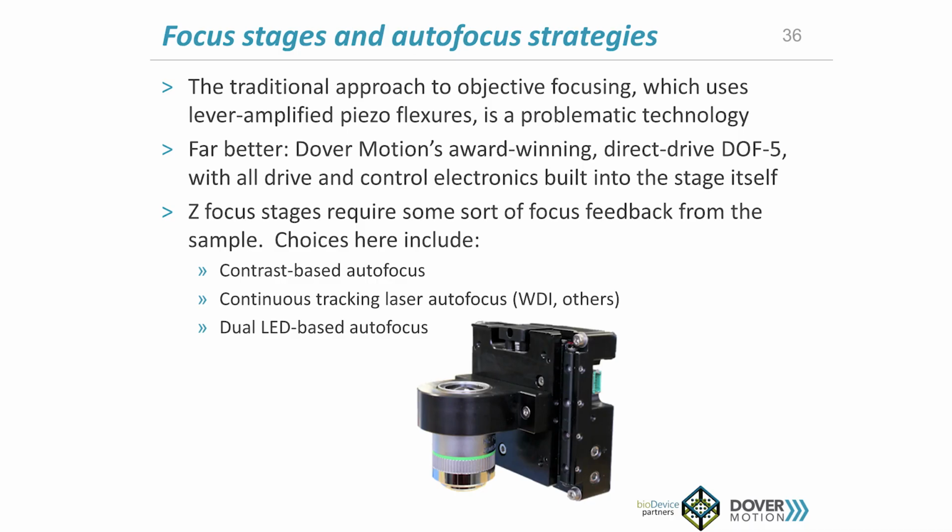As a result, there has to be a Z stage, which typically will focus the objective, and there also has to be an autofocus strategy to inform that Z stage. Now, at the moment, the most popular technique for focusing uses lever-amplified piezo-flexure stages, but these have a number of problems, and we have white papers that go into this.